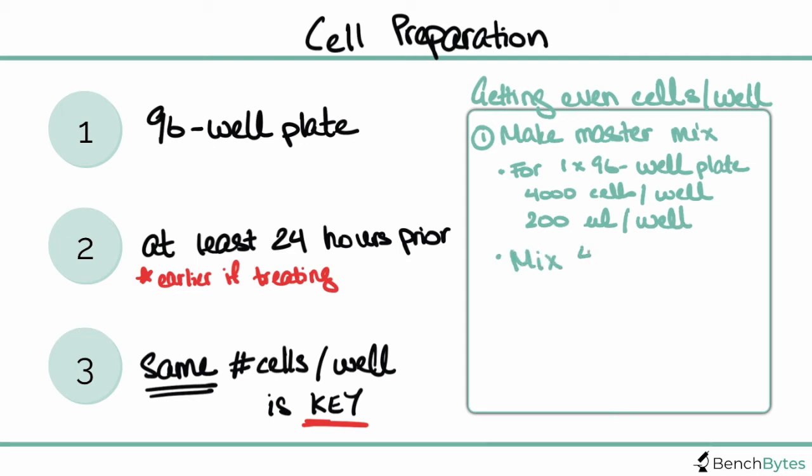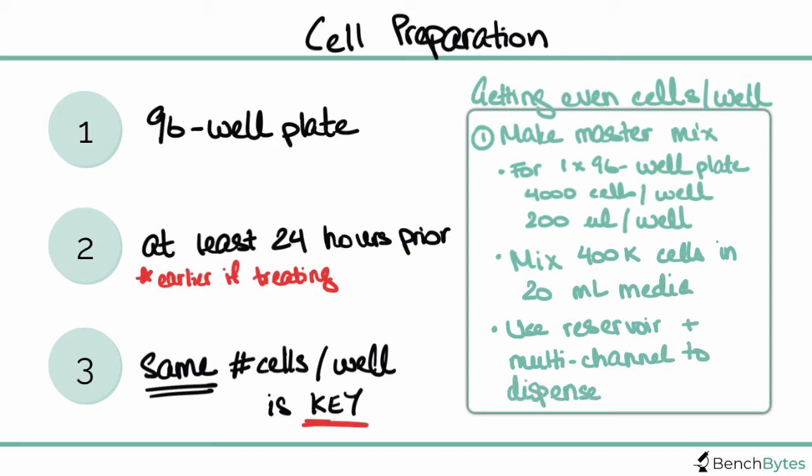To make this, we're going to mix 400,000 cells counted out previously into 20 mL of tissue culture media. Mix that really well, then use a reservoir and a multi-channel pipette to dispense these cells very evenly into our 96-well plate. This is very important because any change in the number of cells in your MTT will severely mess up your results.